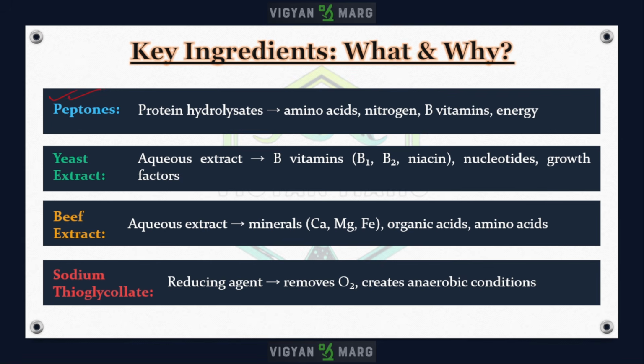Okay, and peptone hydrolysate is partially digested protein from sources like meat or casein, and they provide amino acids, short peptides, nitrogen, and an energy source, as well as vitamins. They are the primary source of nitrogen in most complex media. Okay, nitrogen is the primary source.